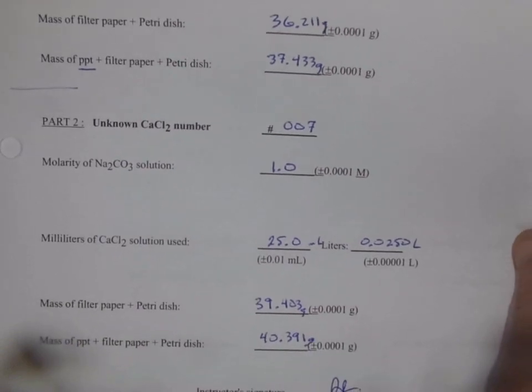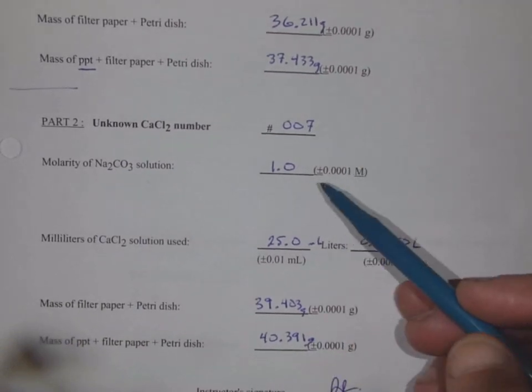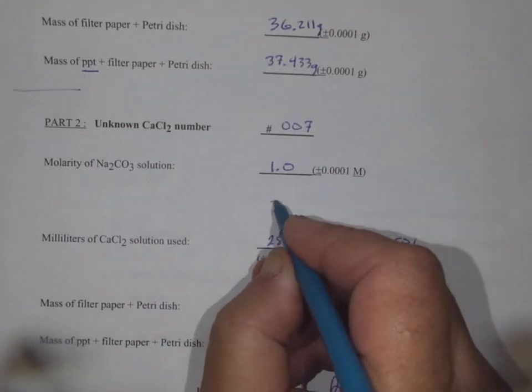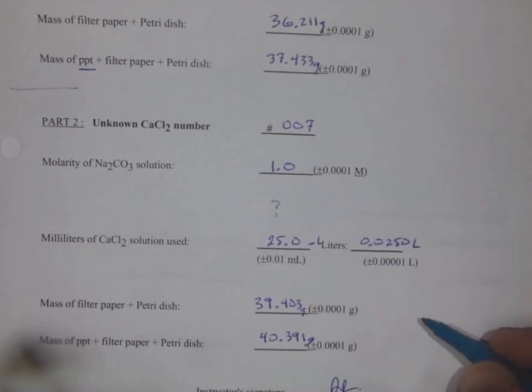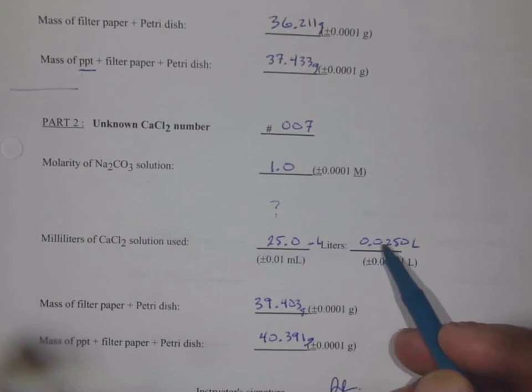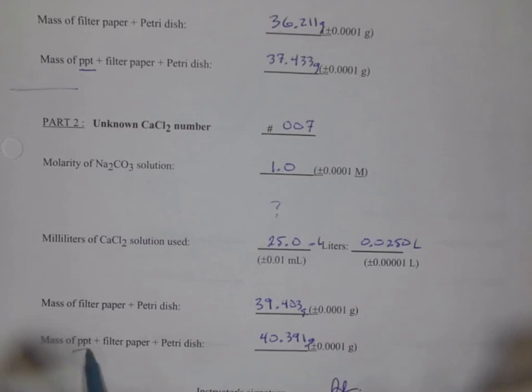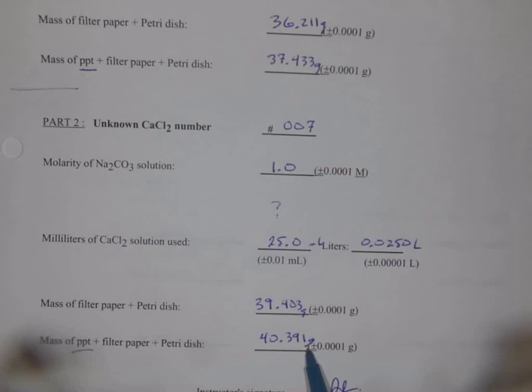Might as well do our data for part two. So in part two, we grabbed unknown 007. We're still using that same one molar sodium carbonate solution. We don't know what the concentration of the calcium chloride is here. That's what we have to find out. But we're using 25 mils of it or 0.025 liters. The second half of the petri dish with a new piece of filter paper is 39.403 grams, and once we've collected and dried our product, we have a combined mass with the precipitate of 40.391 grams. These are the unknowns, and you'll do the calculations on those.